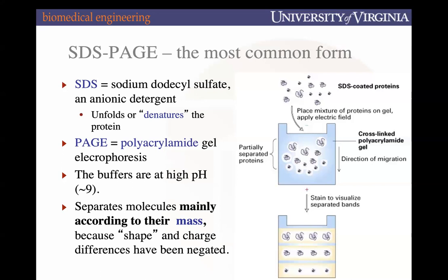a negative charge. And the key thing to note here is that in electrophoresis, we typically can separate proteins based on either their charge or their size. With SDS-PAGE, remember, the anionic detergent SDS bombards every protein with a negative charge. So we're not separating by charge here. We're only separating by mass or size. And typically the units for that are kilodaltons. So daltons are typically grams per mole.